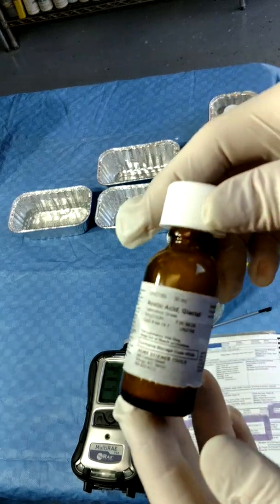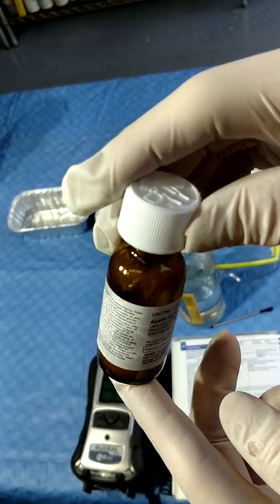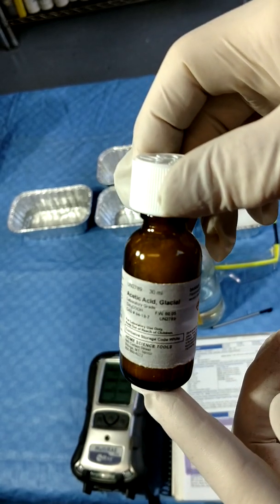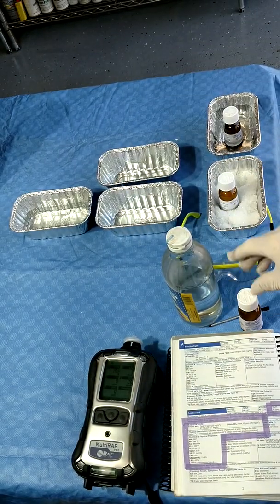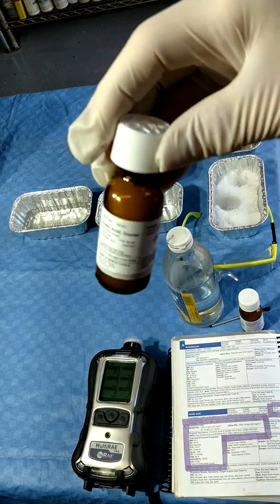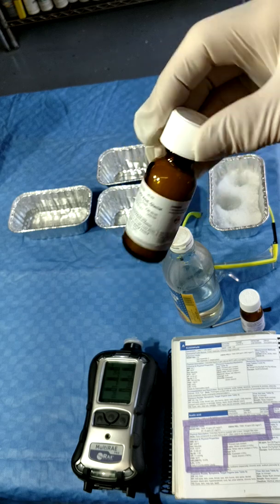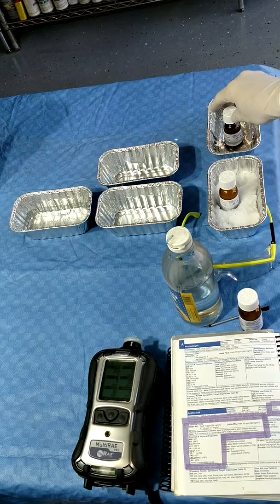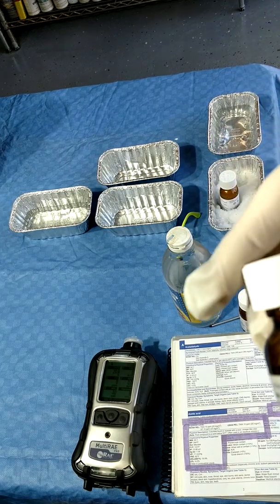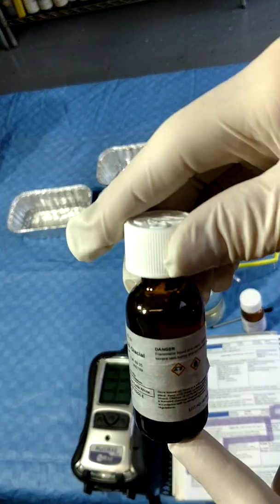You can see both solid and liquid phases in this bottle of glacial acetic acid. I have this one in a snow bath, and it is totally solidified. This one in a warm bath, totally liquid.